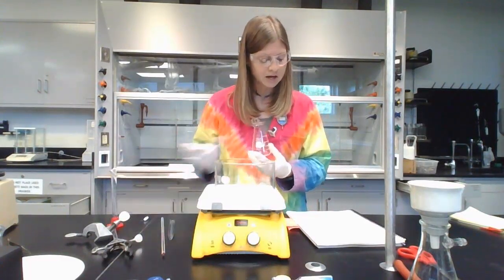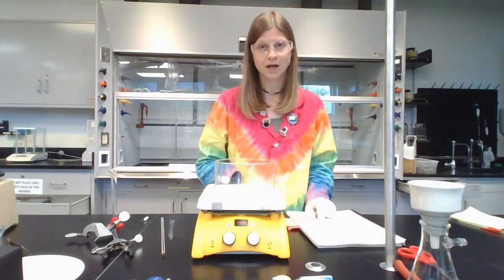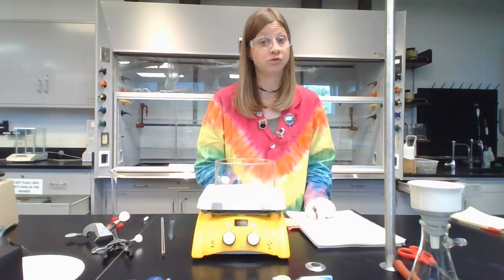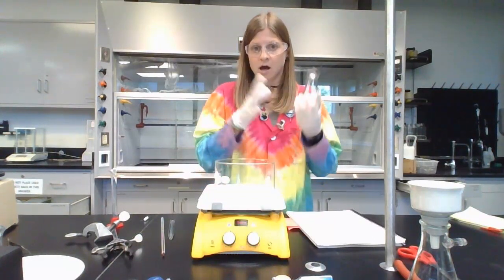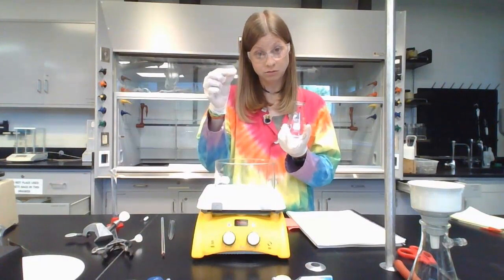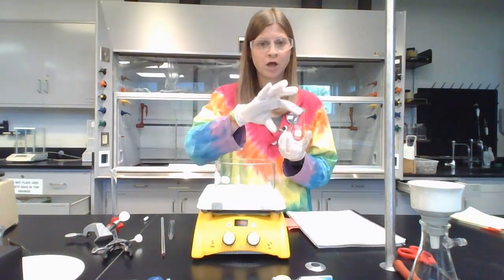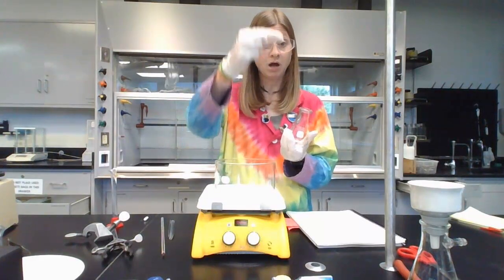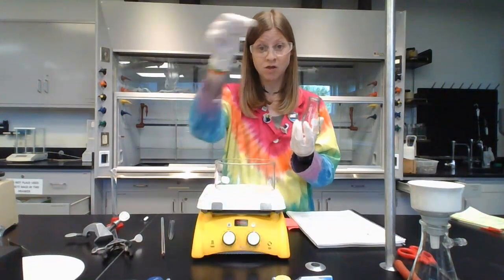And then next we need to add sulfuric acid. Now, it just says in the procedure concentrated sulfuric acid, 18 molar sulfuric acid. This stuff can burn you. This stuff is definitely hazardous. So you're only adding 5 drops of this. The bottle of concentrated sulfuric acid will be sitting there with a dropper bottle or disposable plastic pipette right next to it. You're not going to pour the concentrated acid into another container. All you're going to do is use that disposable pipette to dip it into the solution, fill it up, bring it out, and squeeze 5 drops into your reaction mixture, and then put it back.